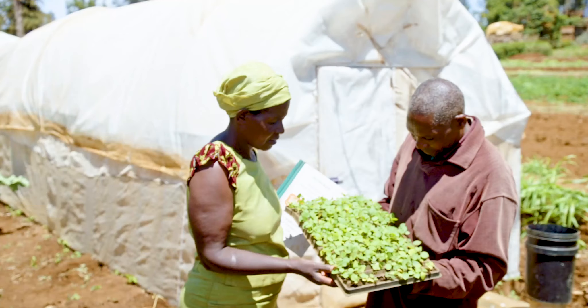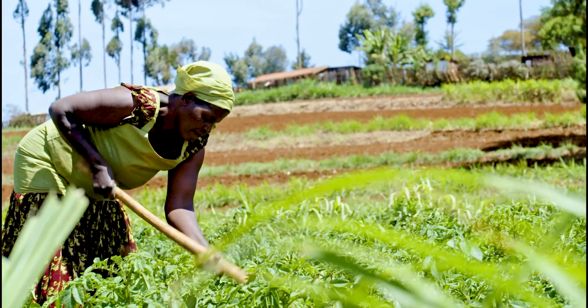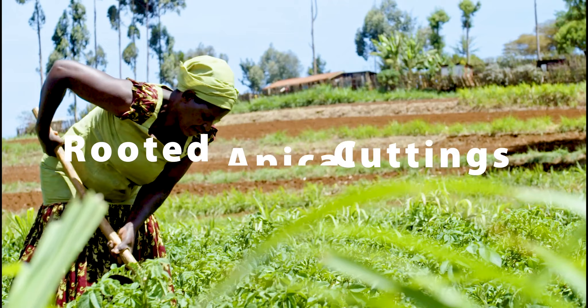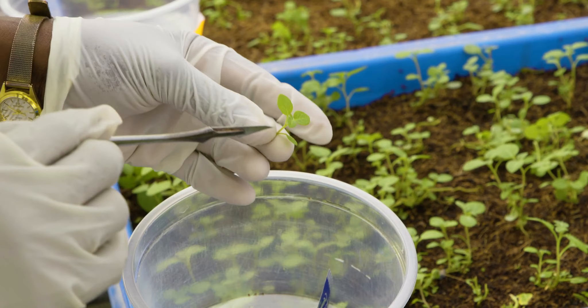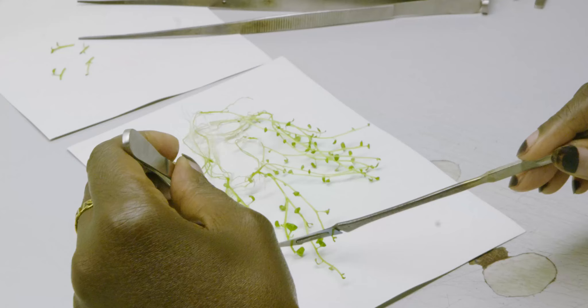Mini-tubers have been the standard starter material for seed production. The introduction of rooted apical cuttings provides a game-changing technology to complement seed production by accelerating early generation seed production. Derived from tissue culture plantlets, apical cuttings are rooted transplants that can be used as an alternative starter material to mini-tubers.